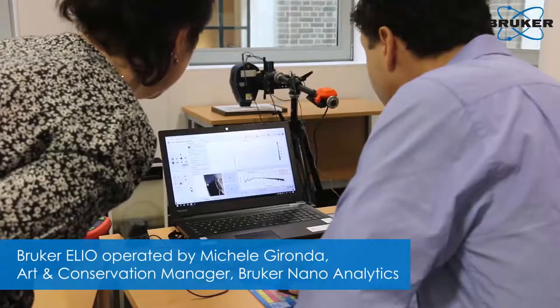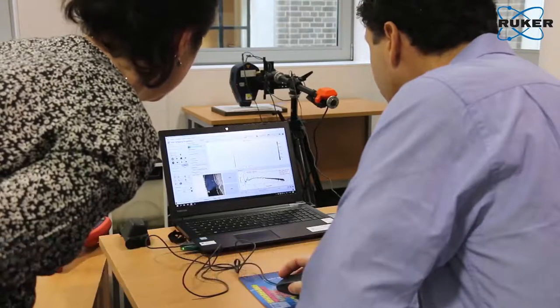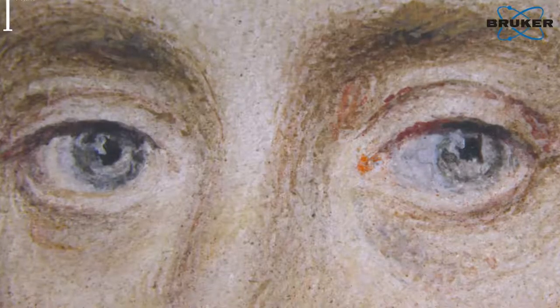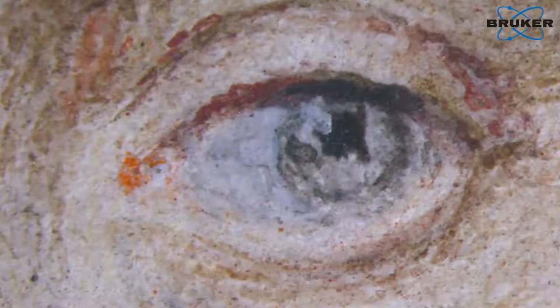We've been doing technical analysis with a number of different scientific methods, including various types of imaging such as near infrared and UV imaging, and very detailed photomicroscopy, so we can get really high-resolution details of the miniatures. This is really important because these objects are very, very small — usually only about five by four centimetres — so the details are so minute that it's really hard to appreciate them with the naked eye.